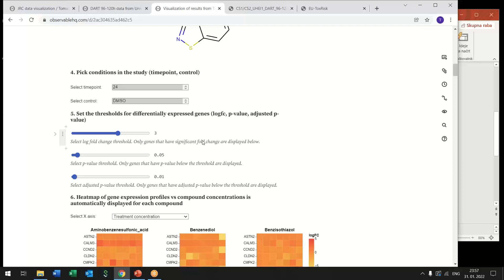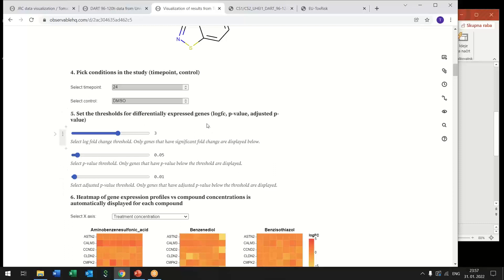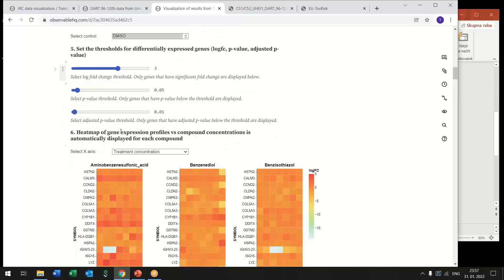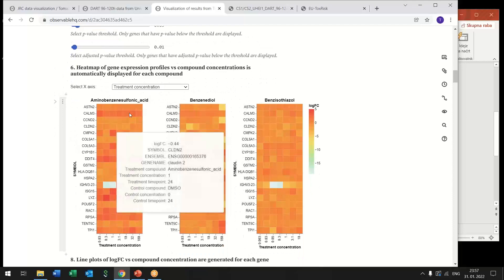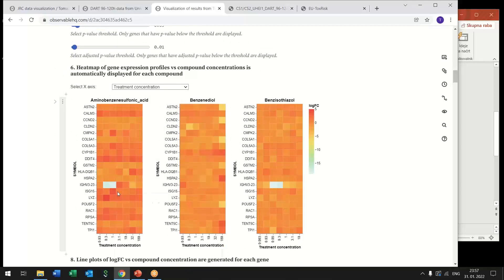Measured for each at each condition and we are always interested only in differentially expressed genes and also the adjusted p-value or p-value thresholds so that only differentially expressed genes are shown below.